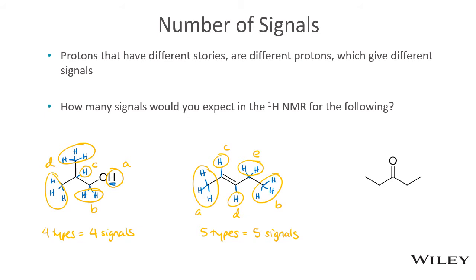And for our last molecule, we have 3 hydrogens, 2, another 2, and another 3.